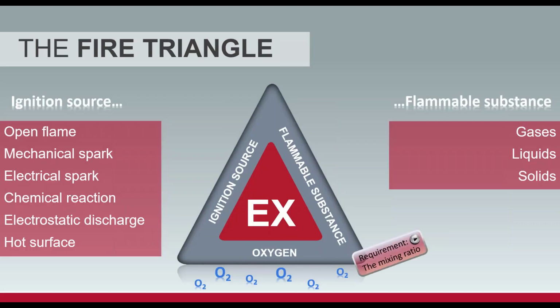All right, so let's talk a little bit about explosion limits and mixtures in the air. When things start to off gas, the International Building Code also references boiling points. Boiling points are important because the more that's off gassed by a chemical, depending on what temperature it starts to put vapors into the room, or if I have a spill or a bottle that breaks, the more vapor there is. Let's look at mixing ratios, and how a rich mixture, an explosive mixture, and a lean mixture work together and what those truly mean.